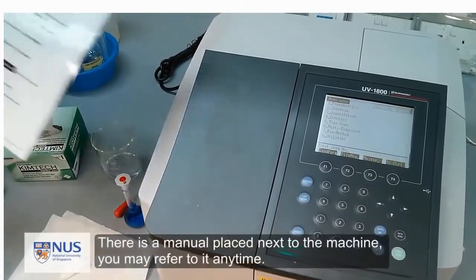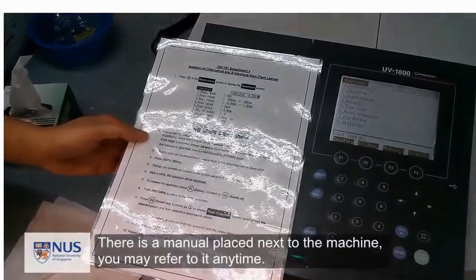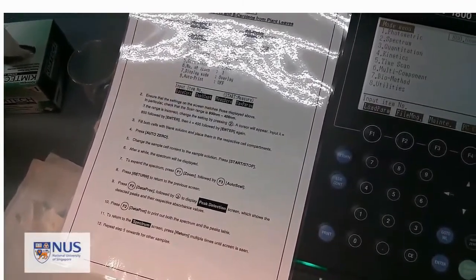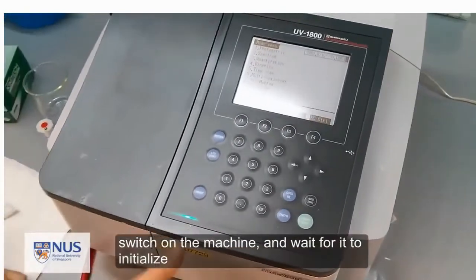There is a manual placed next to the machine. You may refer to it anytime. Turn on the machine and wait for it to initialize.